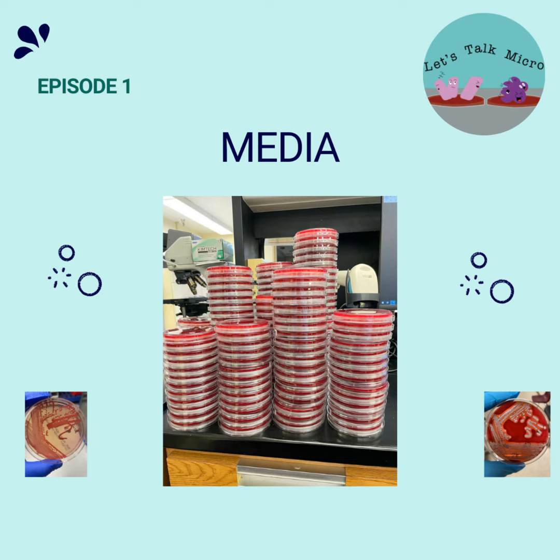That's why we catch infections. Organisms like our body temperature. So these incubators are set to 35 to 37 degrees Celsius to mimic that temperature. In addition to the temperature, we need the correct pH. And the books show that most clinical bacteria like a range of 6.5 to 7.5. The media has buffers to make sure to maintain this pH.